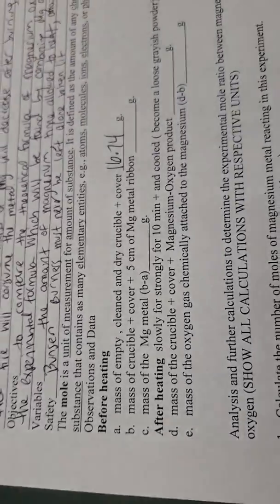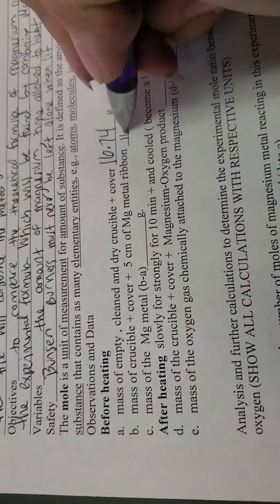Okay? Then I'm going to take the piece of magnesium metal and I'm going to put it inside the crucible and I'm going to get the mass again. Let's say that mass was 16.81 grams.